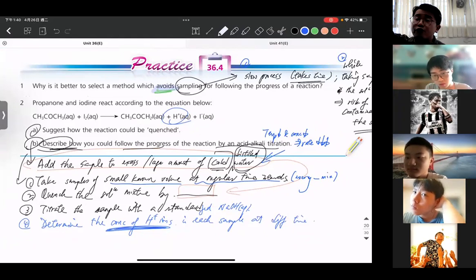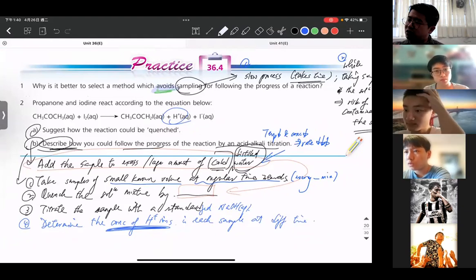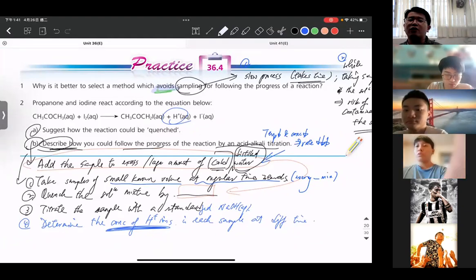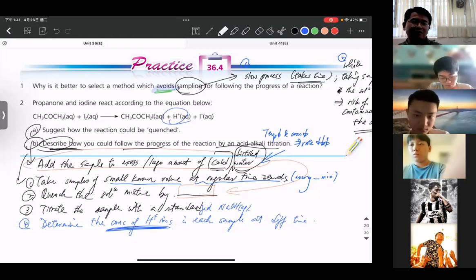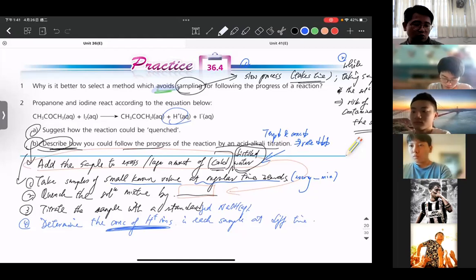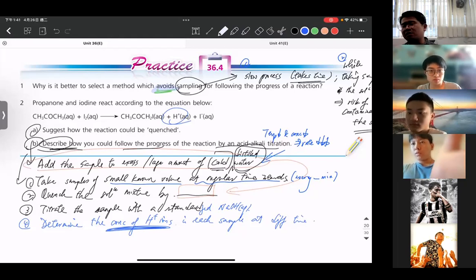Somebody who wants to really make a curve, right? And somebody would not feel so comfortable while dealing with so many titrations. If you really can manage, for example, every 1 minute, take one sample, it is accurate, right? Your curve looks more and more like a curve. 30 seconds? 10 seconds? I tell you, 10 seconds is hardly possible, because when you pipette the solution, it will unavoidably take you more than 10 seconds, right? So 1 minute is our common limit.